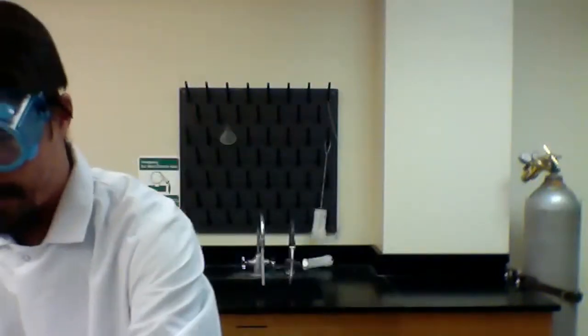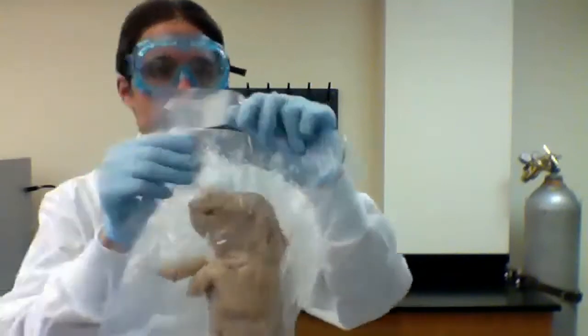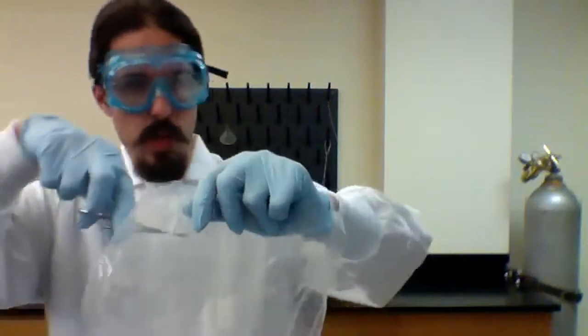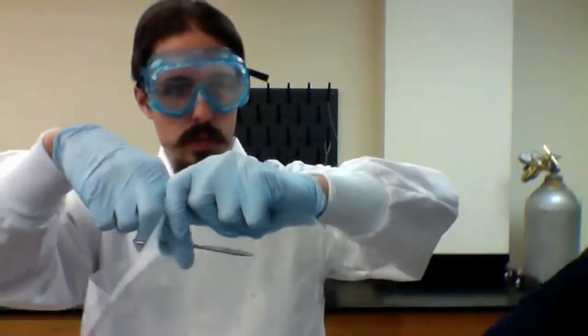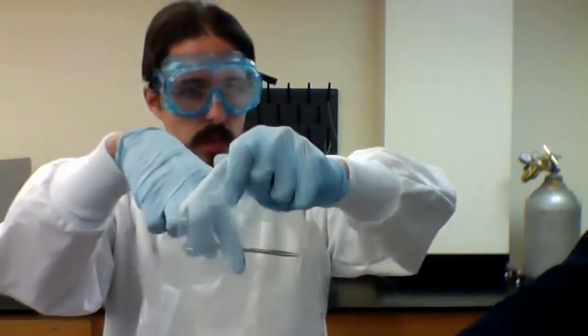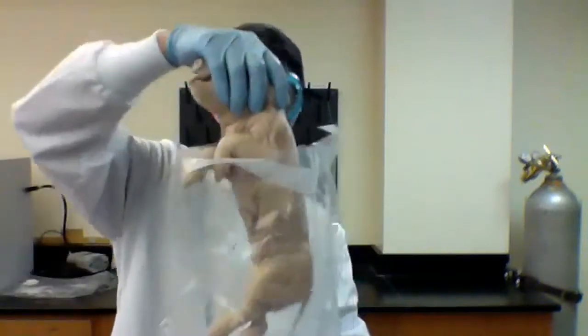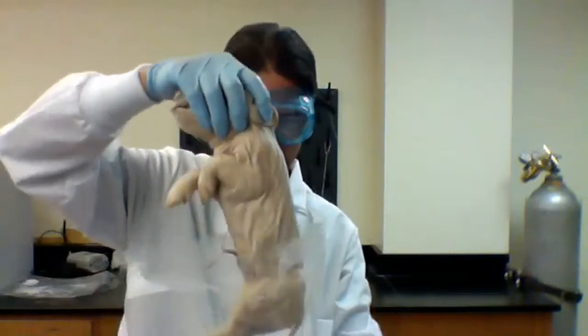All right. So now, just going to cut the top of the bag off. So I'm going to reach in with my hand and pull the pig out. Let it drain or you'll have a mess.